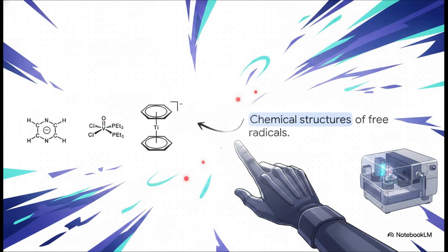Because of this intense, hyper-localized sensitivity, ESR is the perfect tool for analyzing specific tricky compounds. Whether we're looking at incredibly unstable organic free radicals generated in real time or complex transition metal centers with wildly varying g factors, ESR just cuts right through the noise and zeroes directly in on the unpaired electrons.